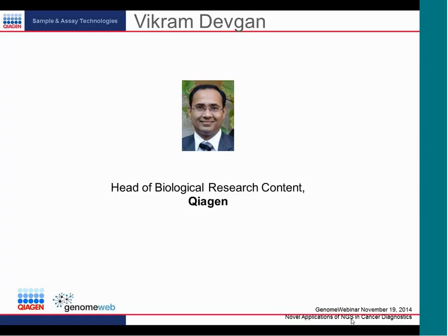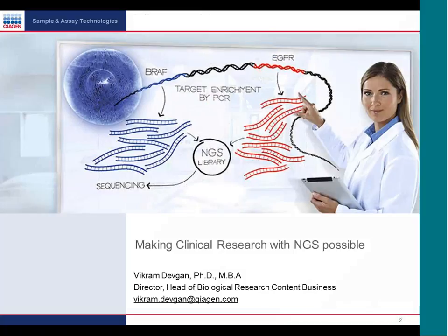Thanks, everyone. First of all, I would like to thank Professor Büttner for providing such a wonderful presentation. You have already heard real-life examples of the applications coming out of QIAGEN GeneRead panels, and not only the panels but also the applications of the QIAGEN sample to insight next-gen sequencing workflow. So what I'm going to do today is follow up on what Professor Büttner has said, and talk more about targeted DNA sequencing.